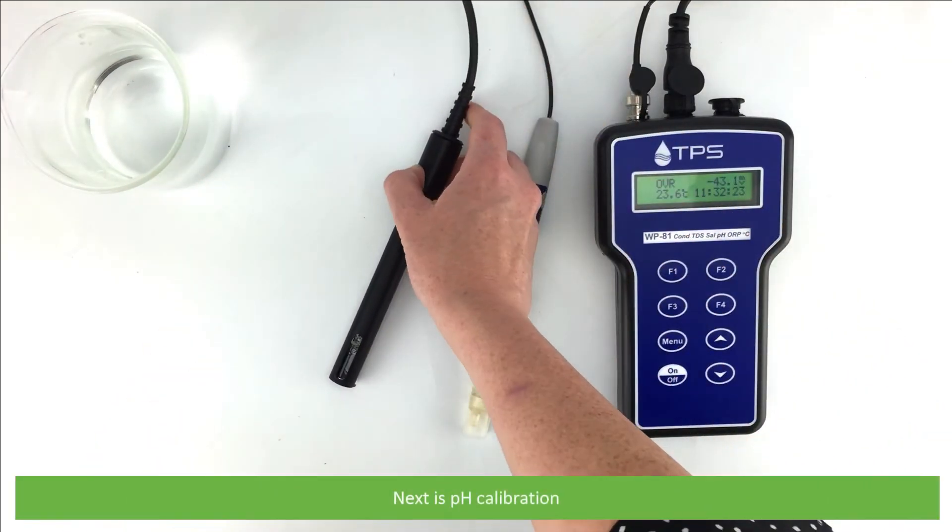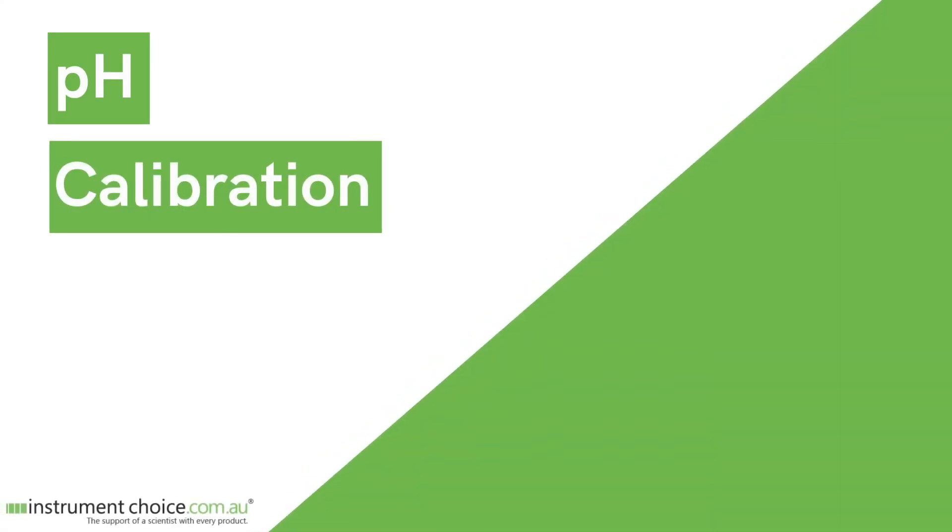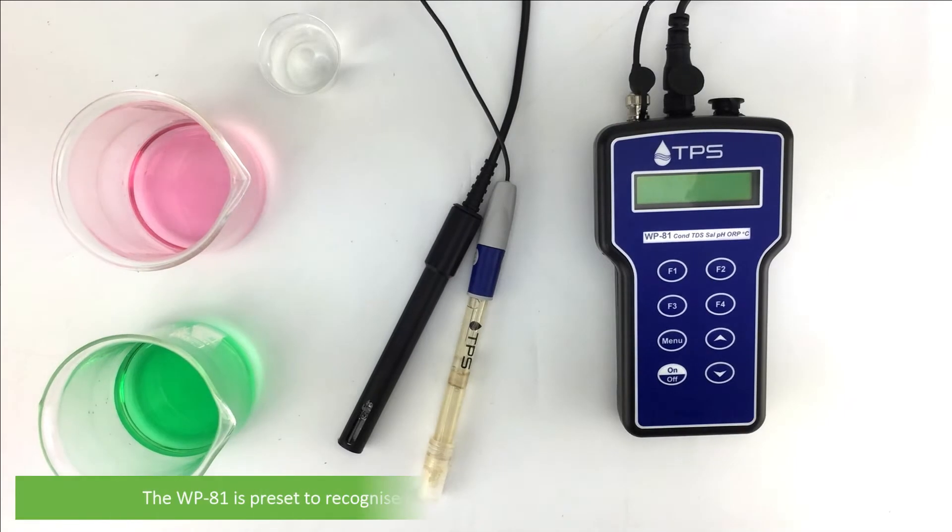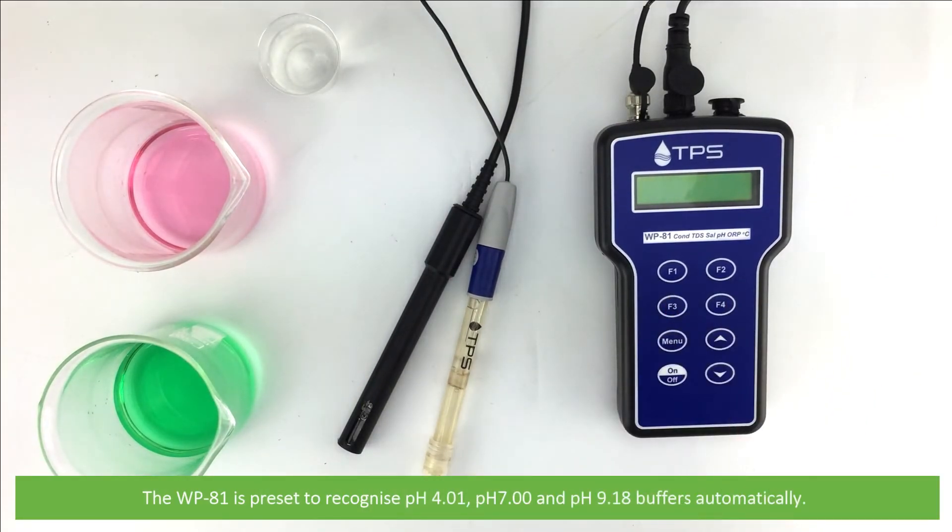Next is pH calibration. The WP81 is preset to recognize pH 4.01, pH 7, and pH 9.18 buffers automatically.